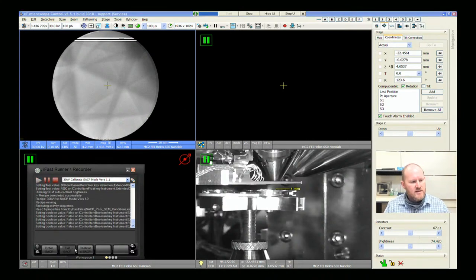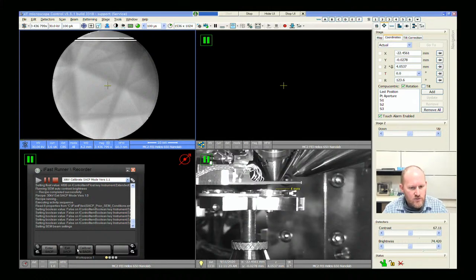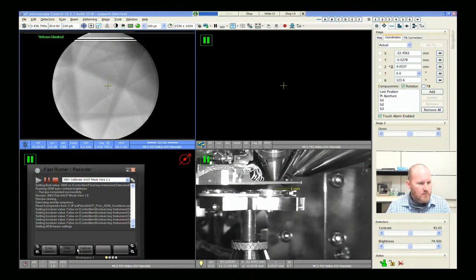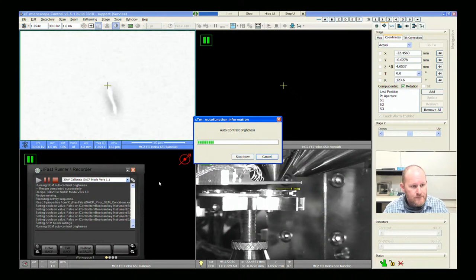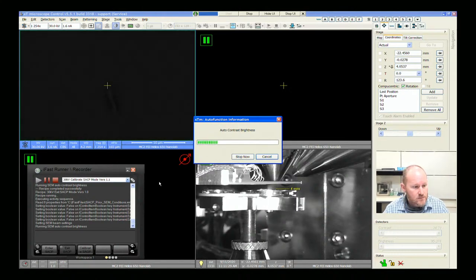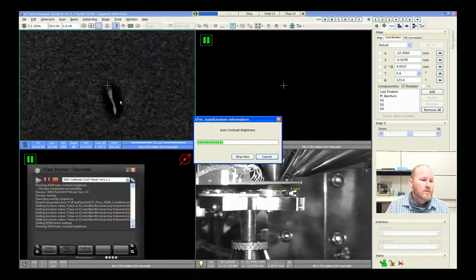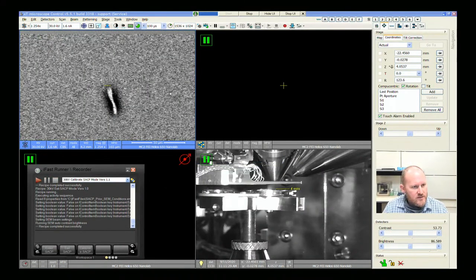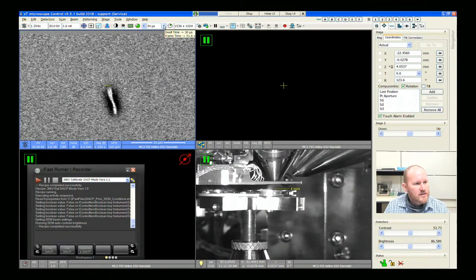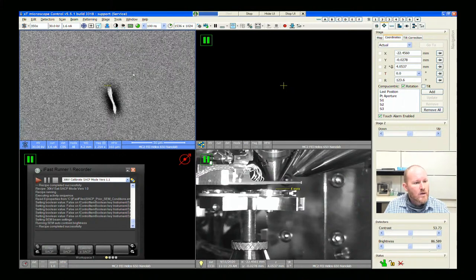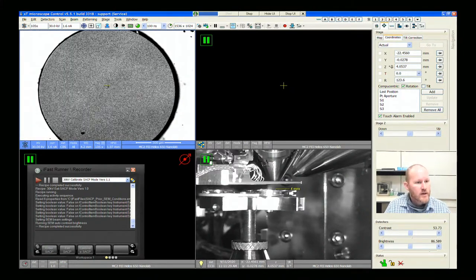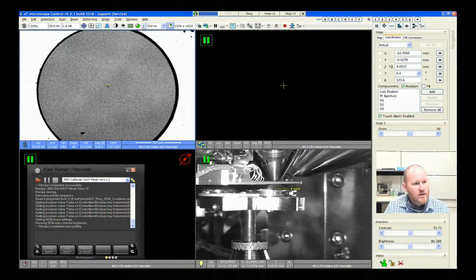Let's go ahead and exit SACP mode — that's going to go back to just regular SEM imaging. We have an auto contrast and brightness as part of our script, but it's not necessary to do that. So here we are in just standard scanning mode. You might be able to see some contrast here because when we scan the beam at low magnification, we're also creating an electron channeling pattern, because you're just changing the angle of incidence between the beam and a fixed crystal.